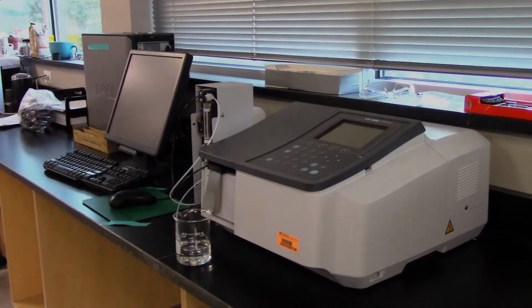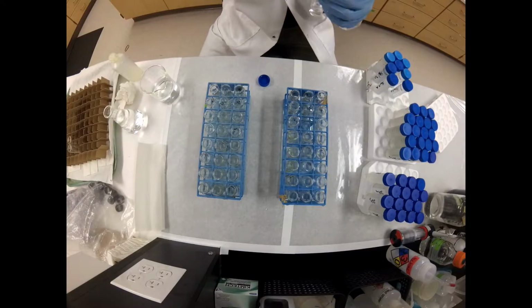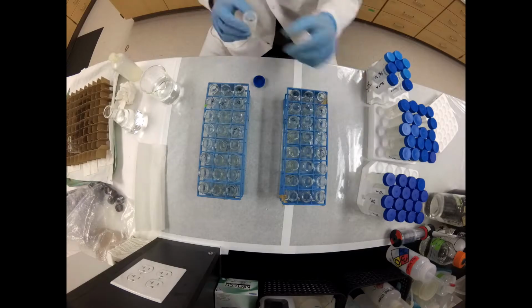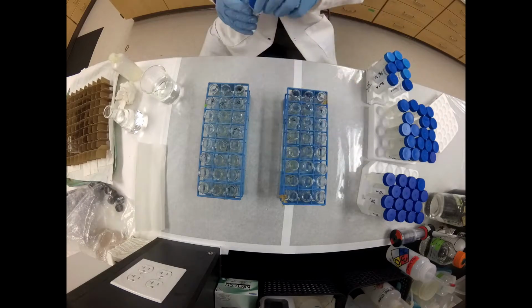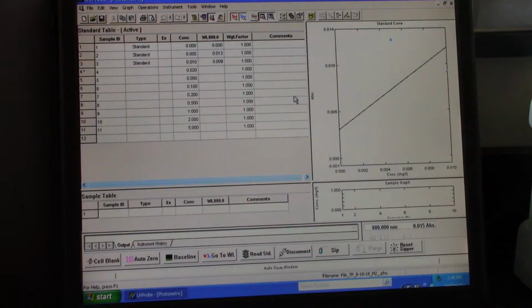The spectrophotometer is a convenient and straightforward tool for total phosphorus and soluble reactive phosphorus analyses. With practice, it's possible to ready and run over 50 samples in the machine within a day. In this guide, we will explore how to prepare aqueous samples and operate this instrument.